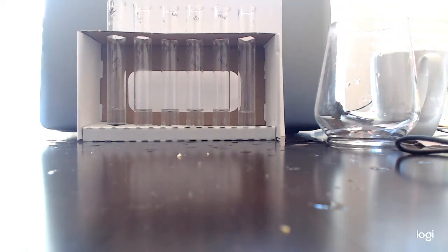All right, there is our solvent. I'm going to go ahead and put in our chemical tests, and by now you probably are familiar with them. Who do we need for starch? Oh no! If you're thinking potassium iodide, you're correct. So let's go ahead and put some potassium iodide into our tube. And 5 drops is going to do. 1, 2, 3, 4, 5.